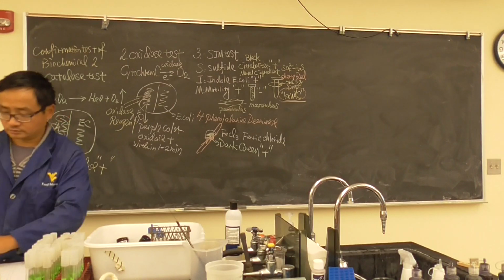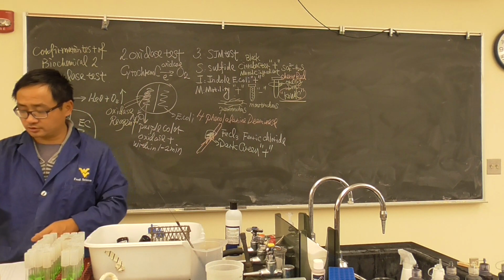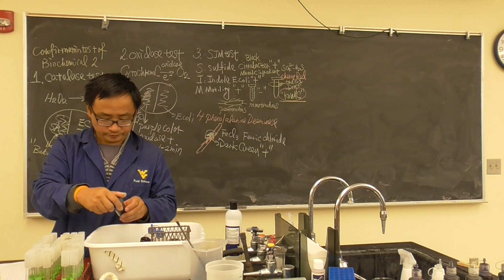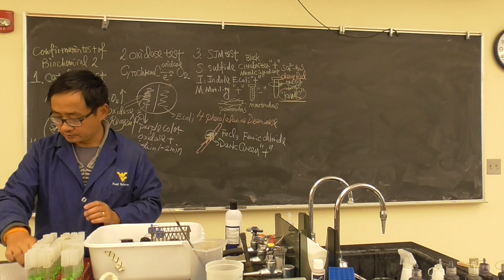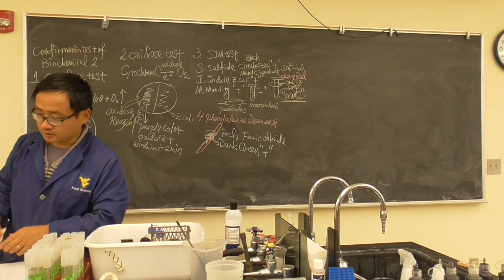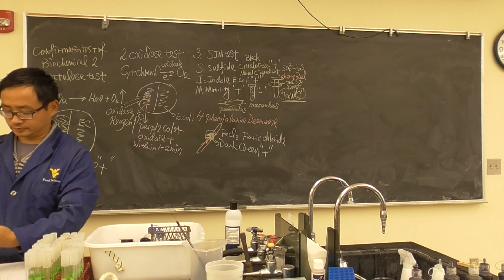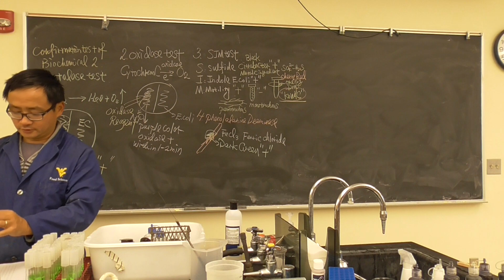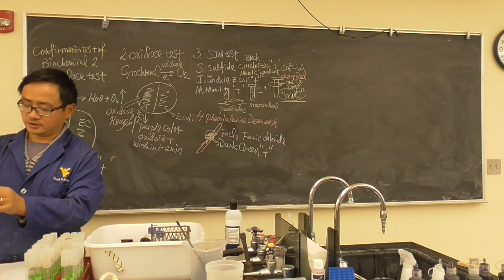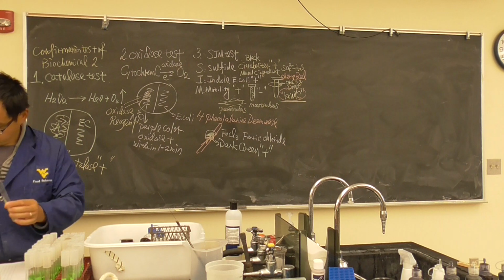Let's do it. Okay, I assuming this is inoculated. I don't know what it is. Staphylococcus aureus, we'll see. Where is ferric chloride? I need to find the reagent, the ferric chloride. On the front of the desk, we can see it. I don't know whether I trusted this or trust the one I bought. Okay, we'll see. So add a couple. We'll see whether it is positive or not. I don't think none of them will be positive.